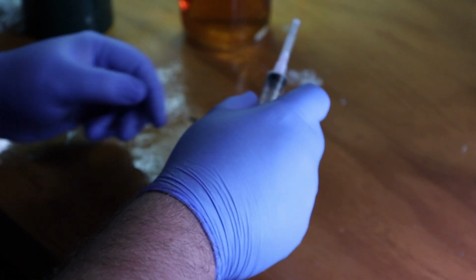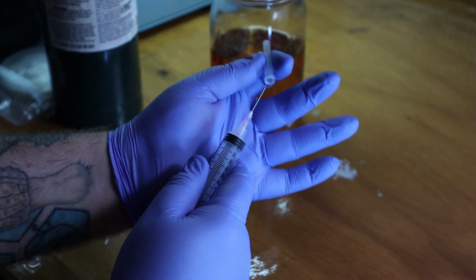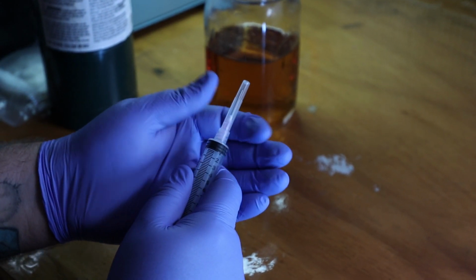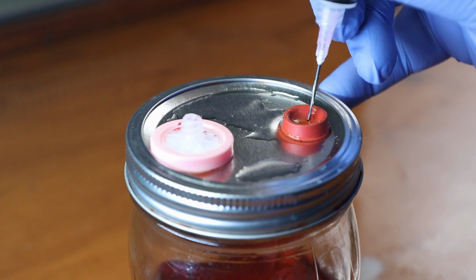Close it up. And then you're going to notice I'm going to take a pistol grip. This is the safest way to uncap your needle. And then you just scoop that cap off, and then you can just scoop it back on. But this way your hands are really stable when you do it, when you grip it in pistol grip on your right hand and then uncap with your left.